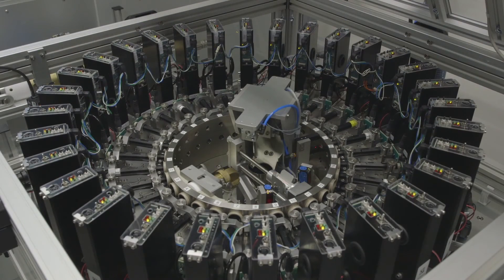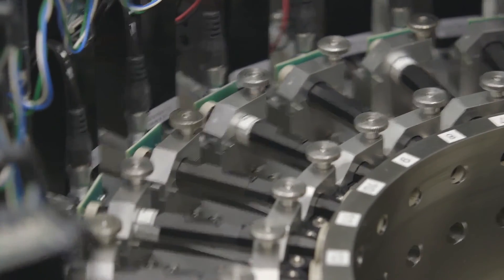In this video, you can see our Platform 1 prototype used to generate an aerosol which is fed into the vitrocell incubator.